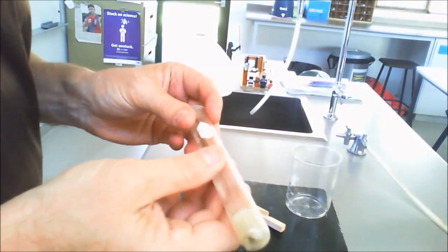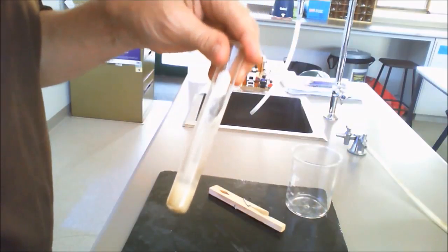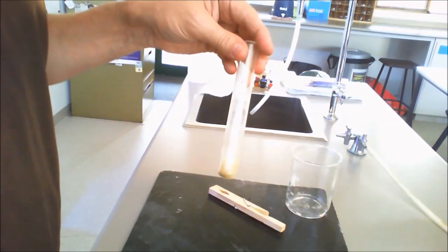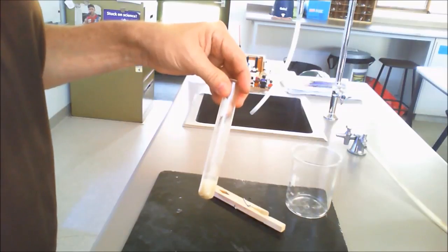Okay, so here's the wax that we're going to melt, which is in the bottom of this particular test tube here. That's probably a better view down there. Again, it's not exactly white because we've been reusing these for a number of years, but you can see the characteristics of the solid that it has.